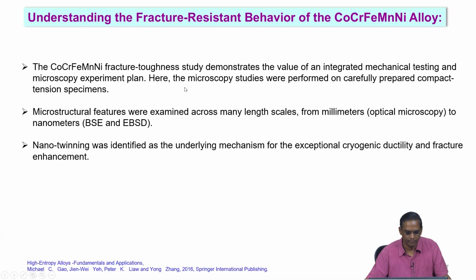So, the fracture toughness study of this alloy demonstrates the value of integrated mechanical testing and the microscopy experiment plan. Of course, the tests were conducted in a compact tension specimen like what I showed you.